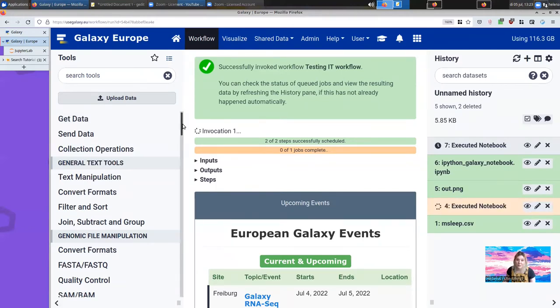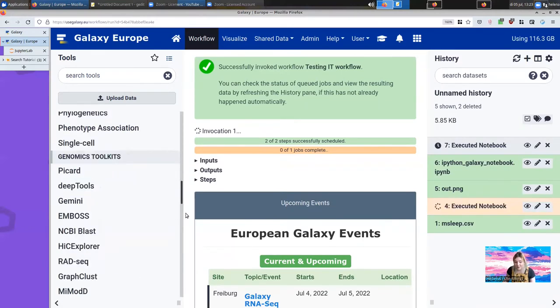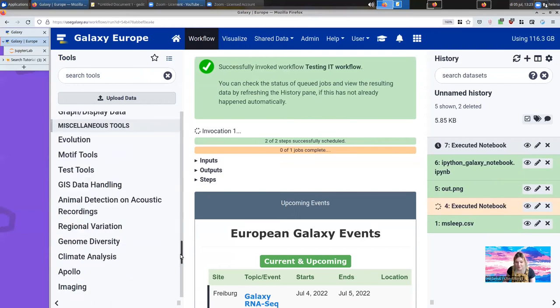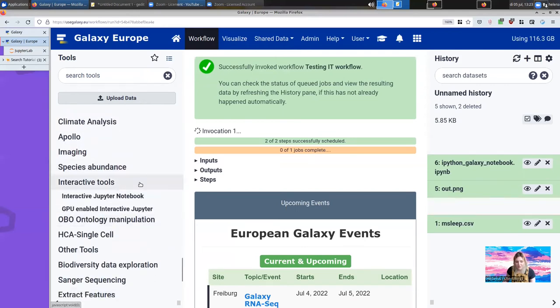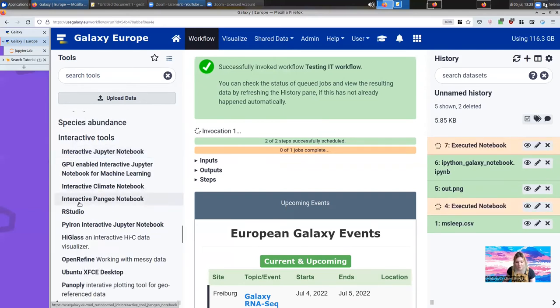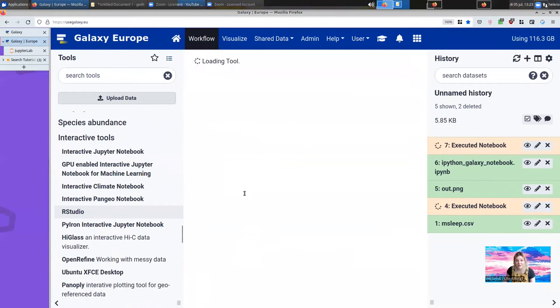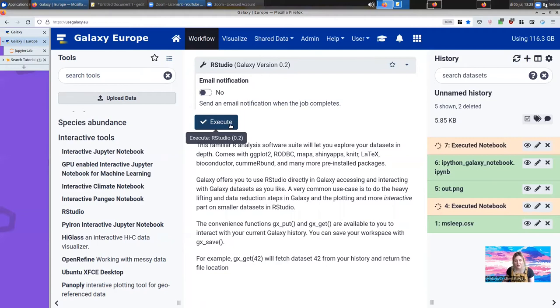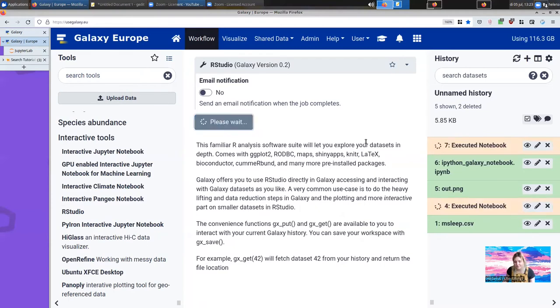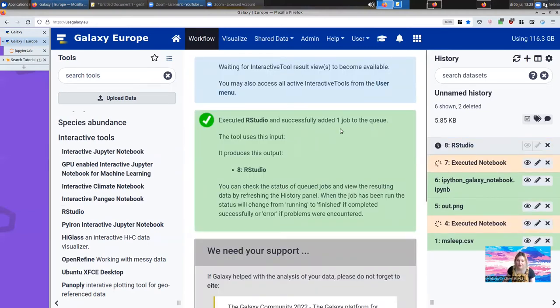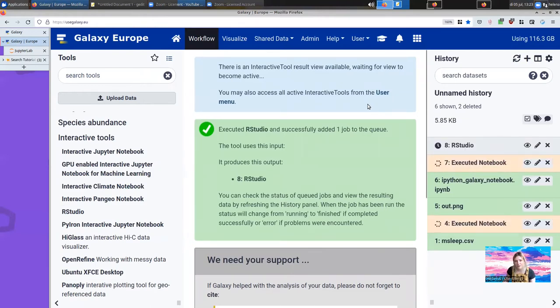But Jupyter is not the only notebook. Under interactive tools, there is also RStudio, another extremely popular notebook. RStudio works exactly the same way as the Jupyter notebook, except it does not let you select data ahead of time. So once you launch the RStudio notebook, you'll be able to load data the same way that we did with Jupyter.